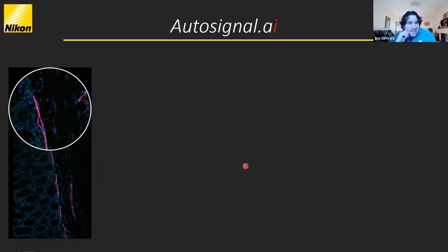All right. Well, when you have the AX, I know one of the things that you teach everybody when they come in to use the confocal is how to optimize parameters. What gain settings do you use? What laser settings do you use? How do you determine if an image is quantifiable? Are there undersaturated pixels? Are there oversaturated pixels? These are the kinds of things that make confocal imaging a little bit more complicated than other types of imaging. There's a few parameters that you have to learn how to use. It's not difficult, but you're kind of working through it, figuring it out.